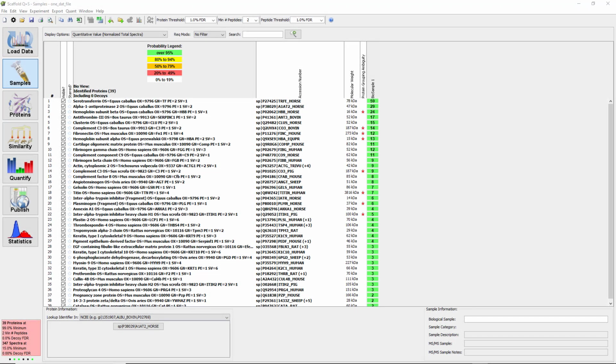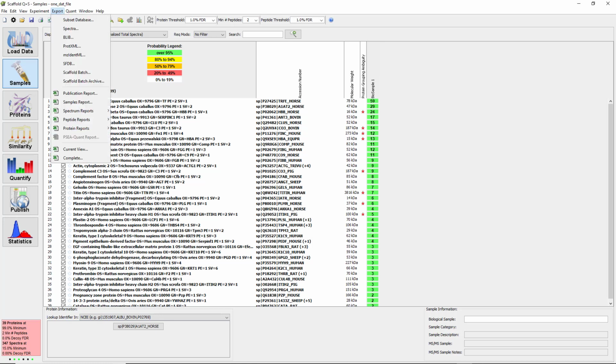Perhaps the easiest way to load data into perSPECtives is to use the new SFDB export in Scaffold. This will write a file that can then simply be opened in perSPECtives without the need to export and then load data. Note the SFDB export was implemented in Scaffold 4.9.0.